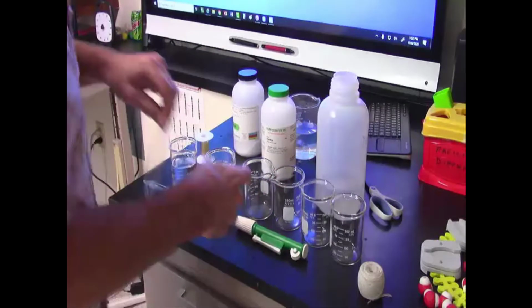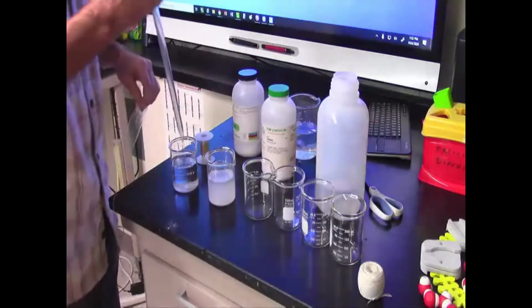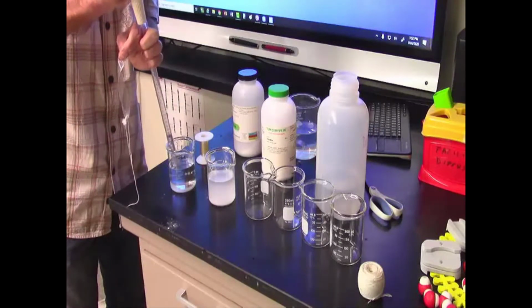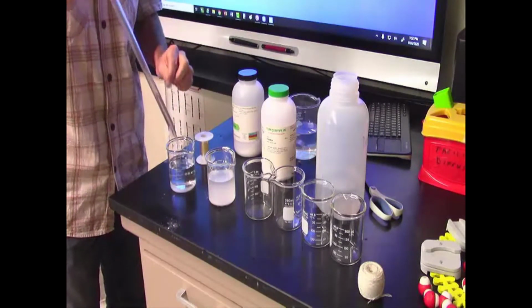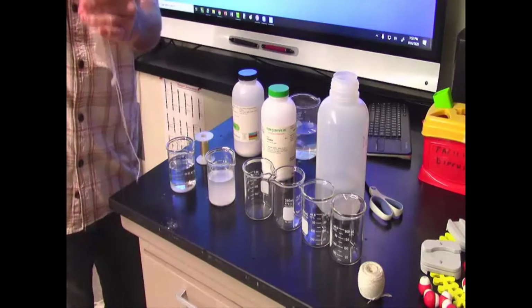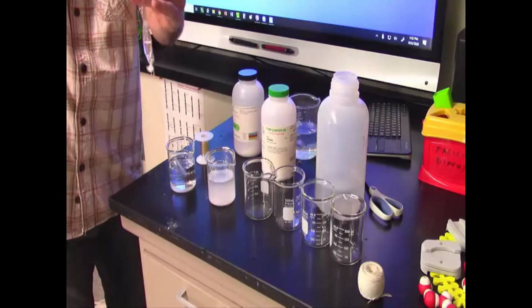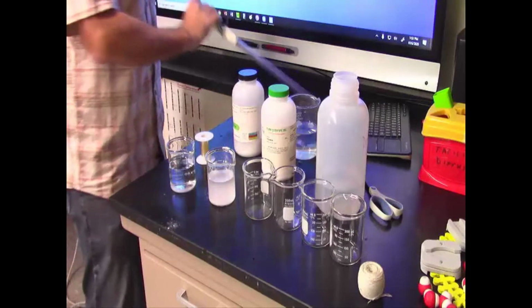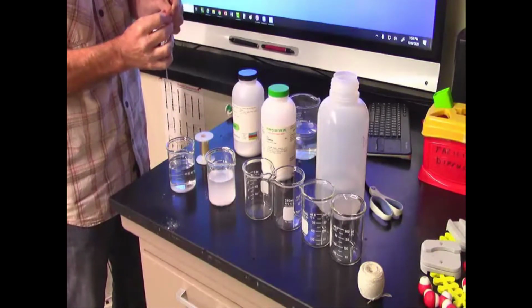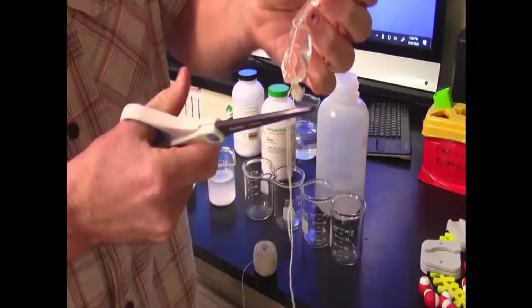Open up the other end, take a pipette, and I think I'm going to use just sugar this time. Use some sugar solution in water and put it in the fake cell. Squirt it in there. And I'm going to tie off this end, just like I did the other one. Kind of twist it and fold it, check our weights.